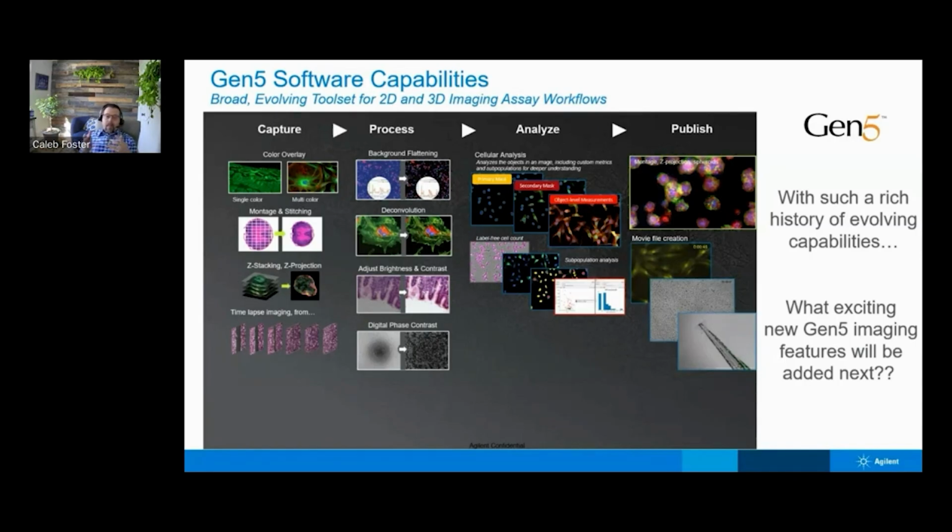And that application is a very simplistic one, but provides great view into answers across, whether you're studying toxicity, like looking at cancer drugs and how they're affecting a monolayer of cells obtained from a patient, or cell growth. If you're working on a wound healing application and you're looking at how quickly cells grow back over time. So I think those models will, in my mind, stay around well into the future.